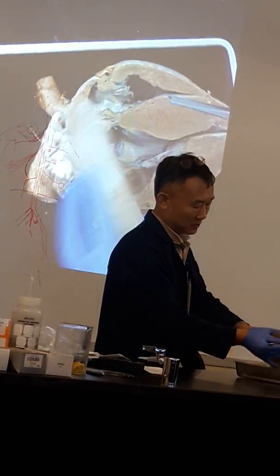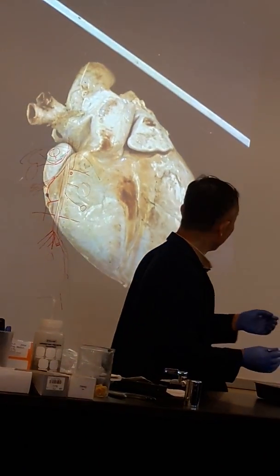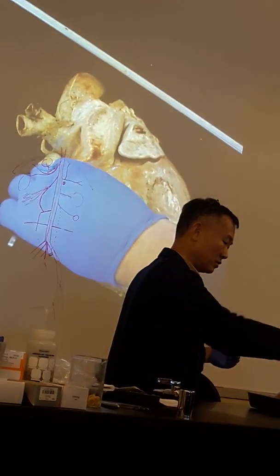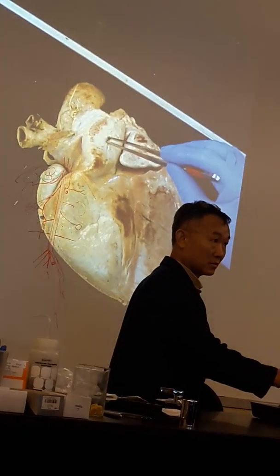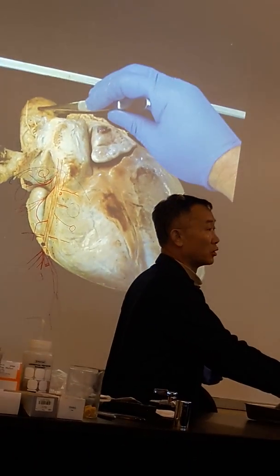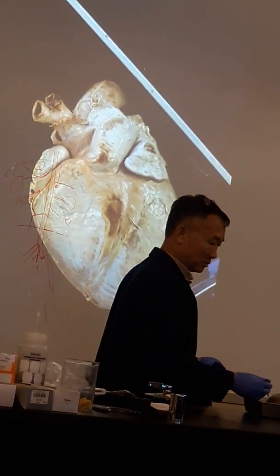Okay, outside. I'm pointing to, this is posterior view. Okay, anterior view. I'm pointing to this. Say this is left auricle. I point this, right auricle. If I point to this, pulmonary trunk. If I point to this, brachiocephalic. If I point to this, you say aorta or aortic arch. Aorta will be correct. Aortic arch will also be correct. Okay?